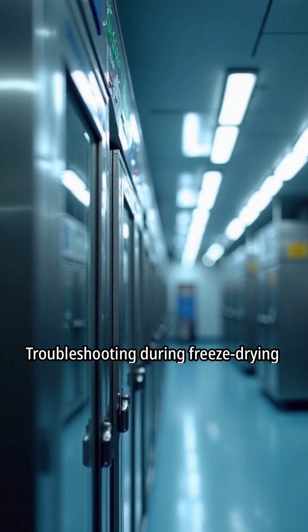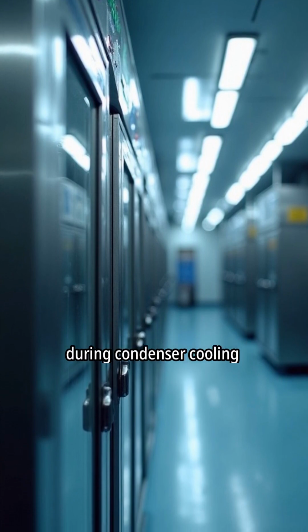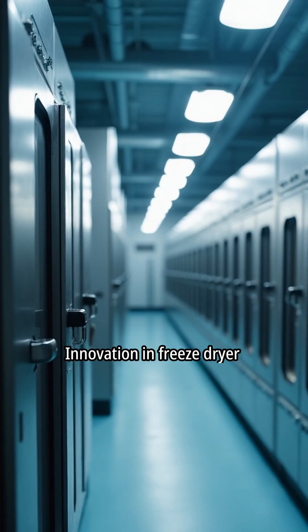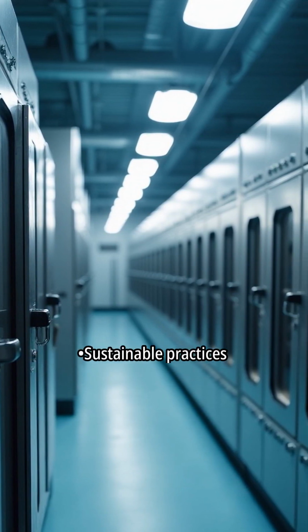Troubleshooting during freeze drying: failure of the vacuum pump, failure of the vacuum pump during evacuation, failure of the refrigerating compressor during condenser cooling, failure of the silicon heater. Innovation in freeze dryer: advanced monitoring system, automation and AI integration. Sustainable practices.